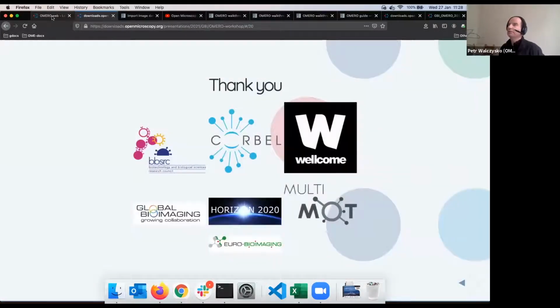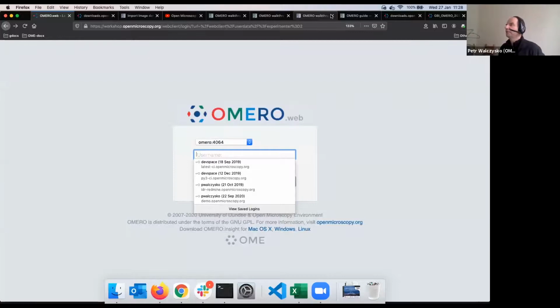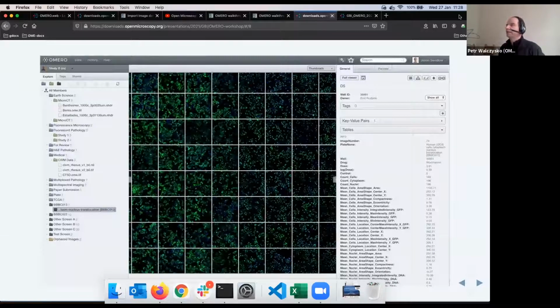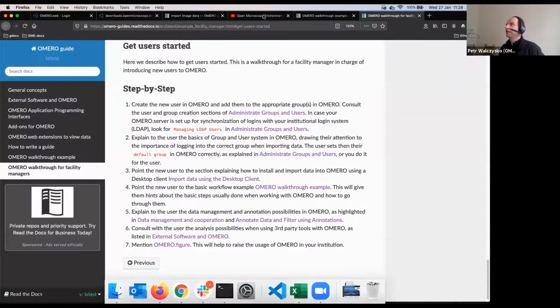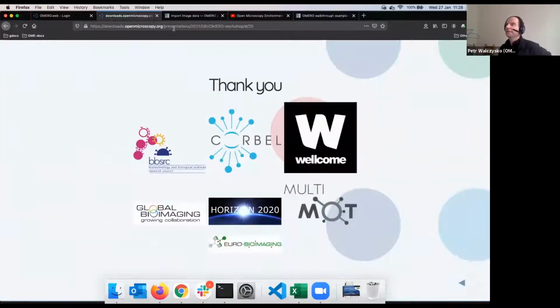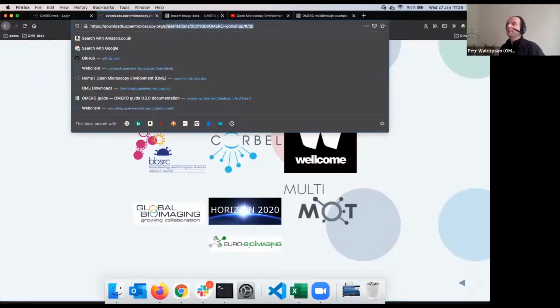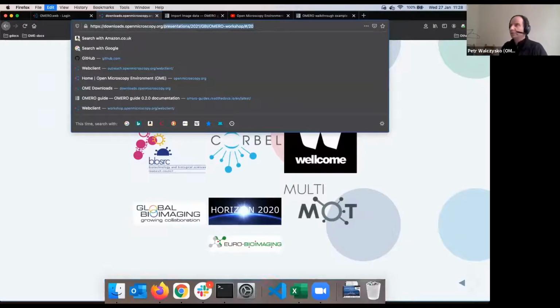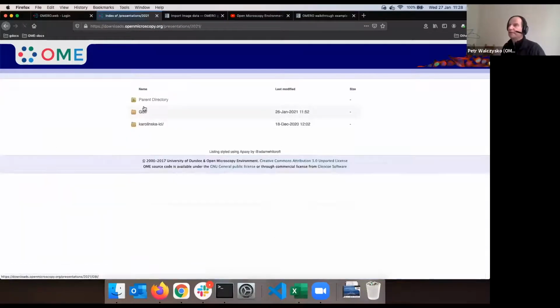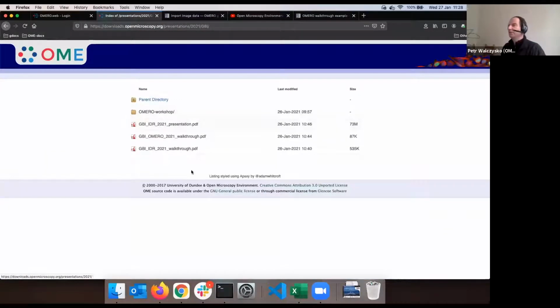Okay, so let's double back on myself because I'm losing the thread. Sorry for the clicking now. I'm closing the tabs here and just trying to make order. So don't get disturbed. It will take a second. I will go back where I was, and this is the first link I was pointing you to.